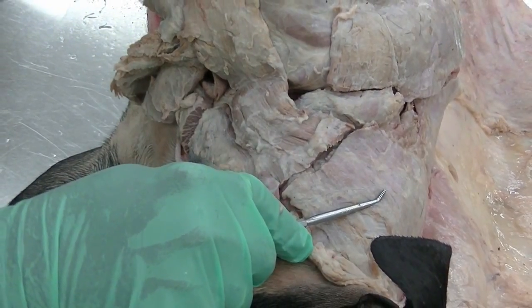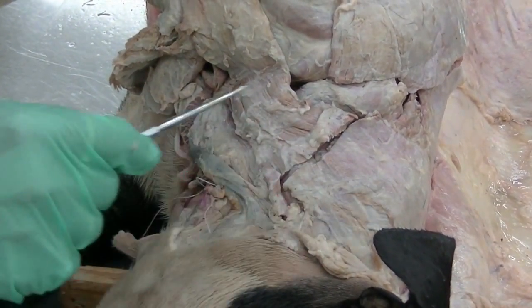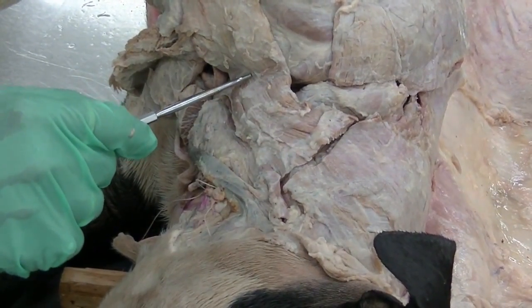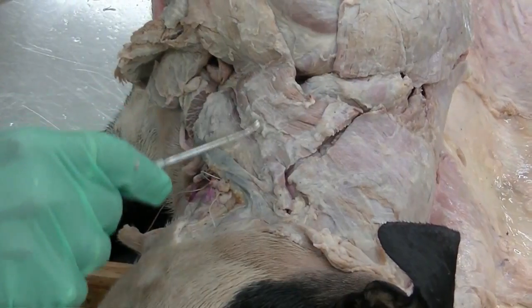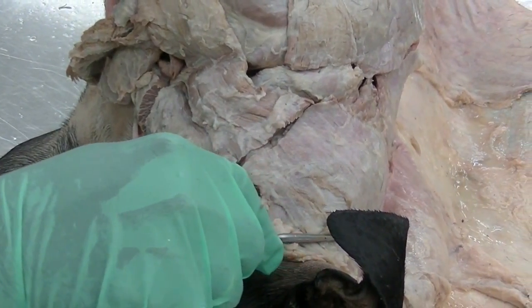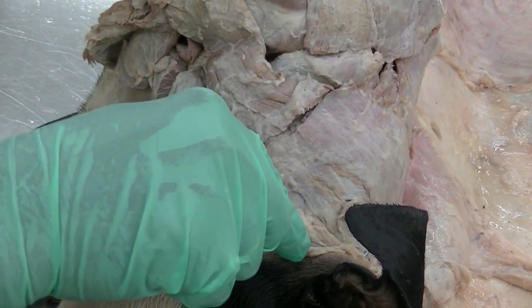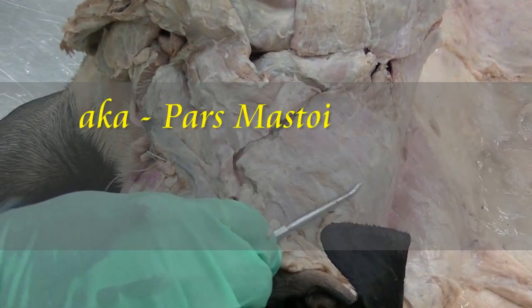The cleidocephalicus is further divided into two different portions. The portion which runs towards the mastoid process of the skull is called cleidomastoideus, and the part which goes towards the dorsal midline of the neck as well as towards the occipital bone of the skull is called cleidocervicalis.